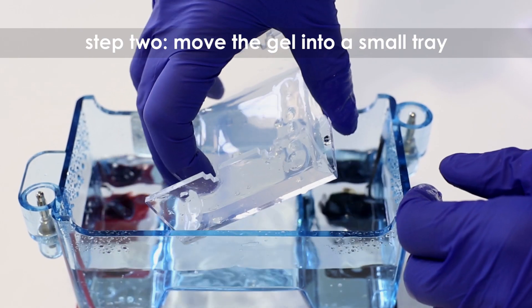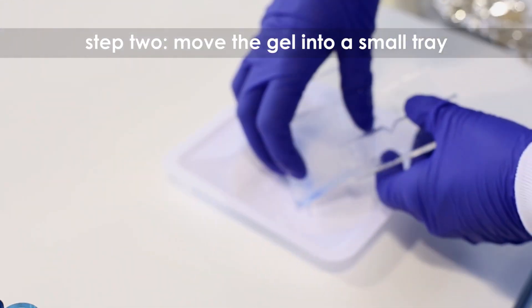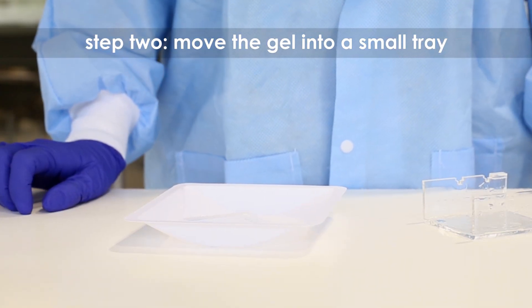Step 2. Remove the agarose gel and casting tray from the electrophoresis chamber. Carefully slide the gel off of the casting tray into a small, clean gel staining tray.